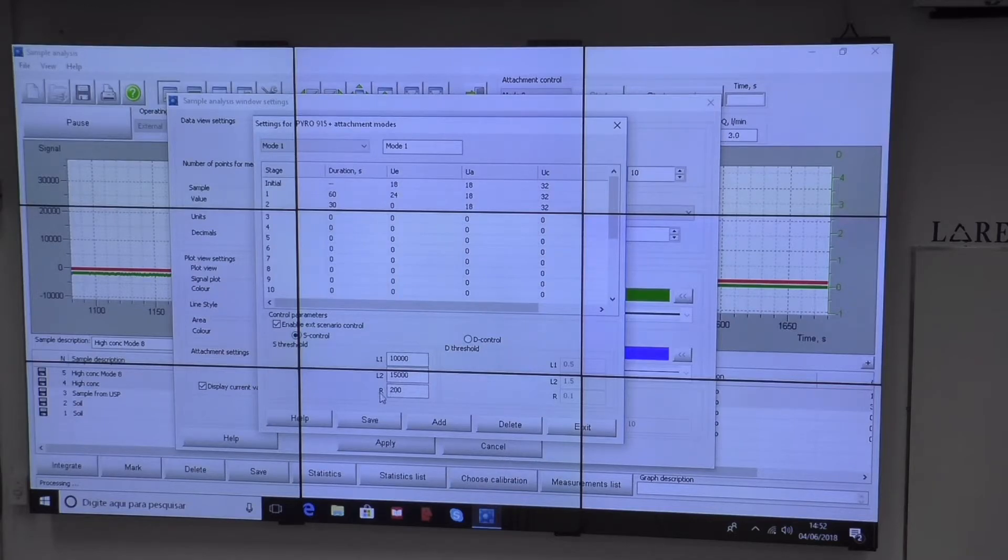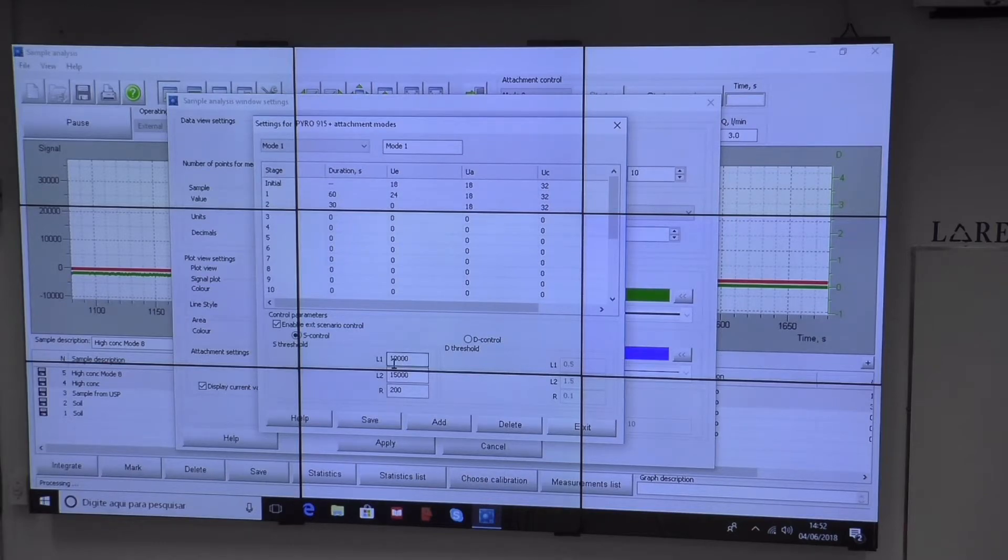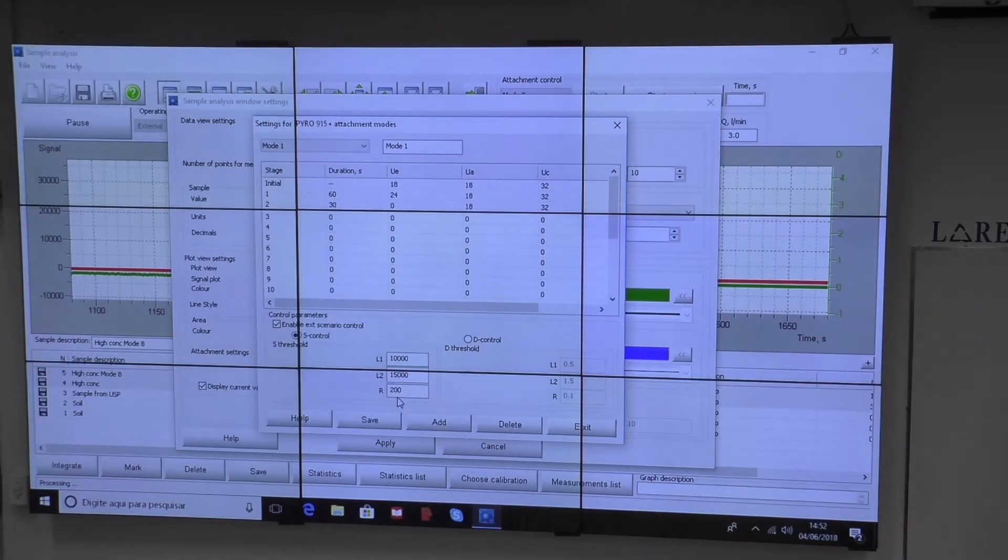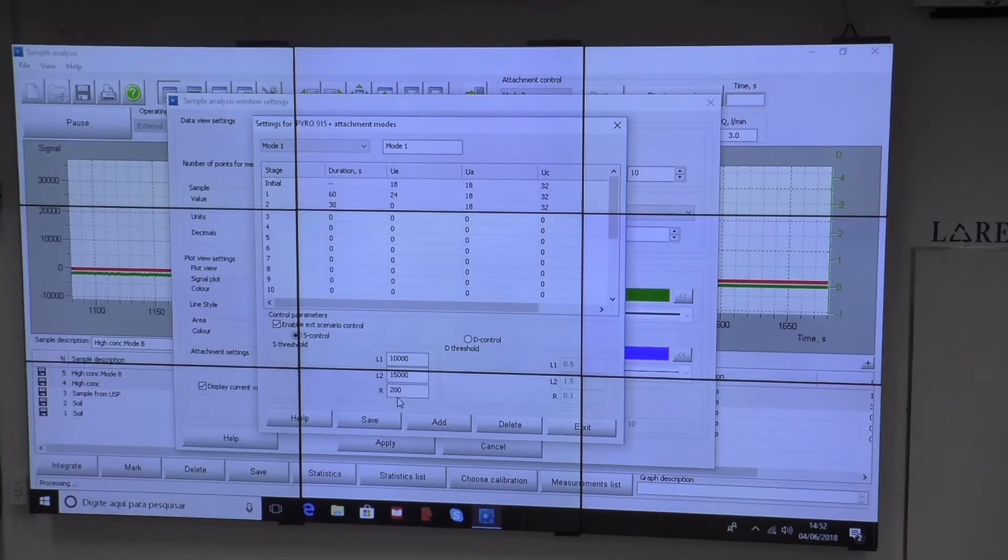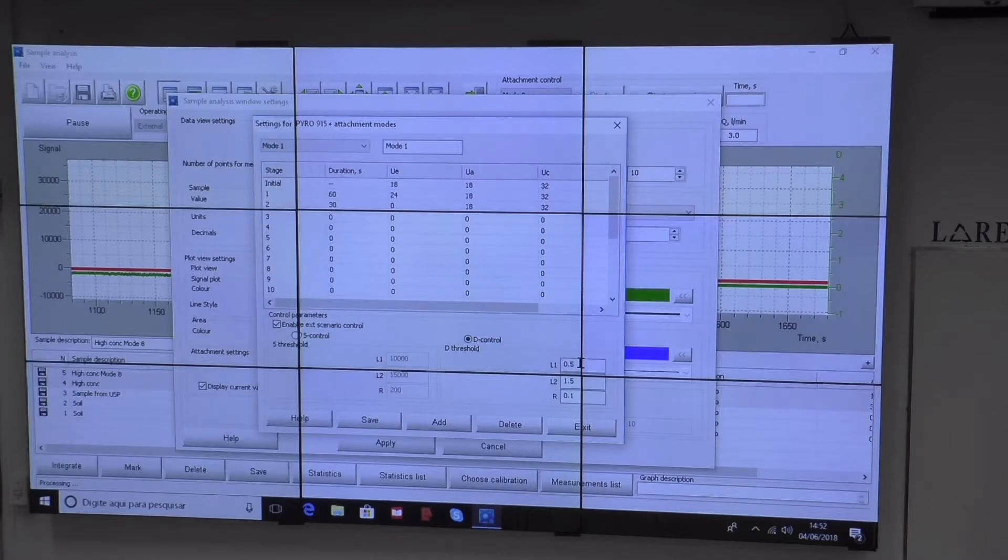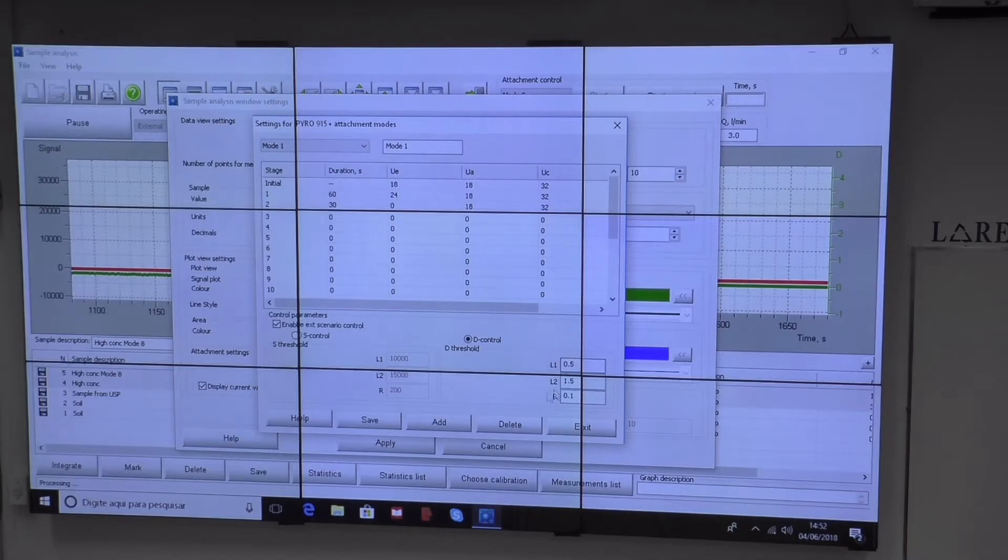If it's rising too fast, it doesn't wait until the threshold is exceeded. It measures if the rate of increase is more than 200 units per second and immediately takes control. The same applies to background—two thresholds and the rate of increase of the parameter. We can also use this.